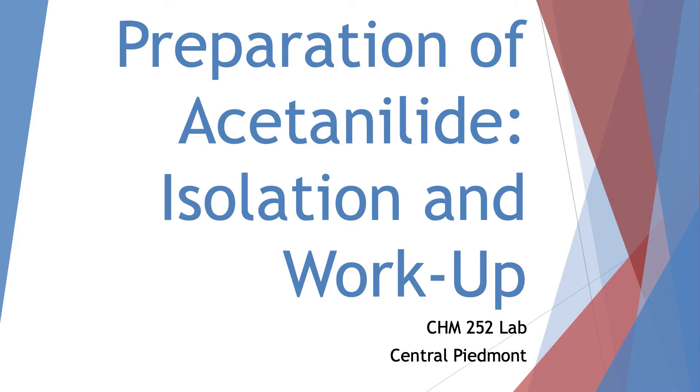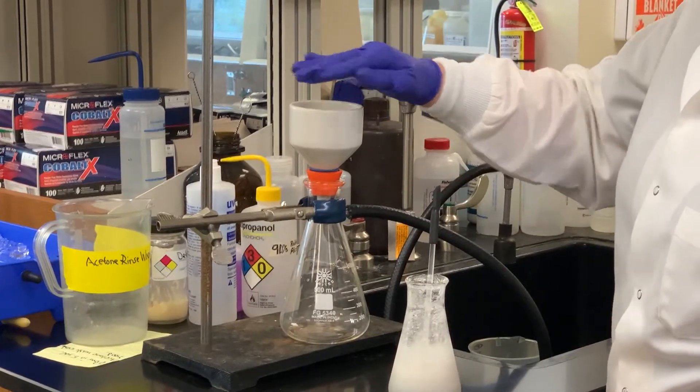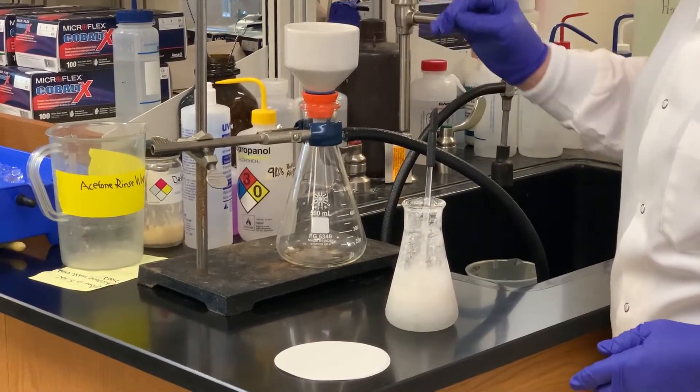So we're ready for the vacuum filtration. Again, always make sure that whatever size filter paper you use completely covers the holes but doesn't creep up the sides.